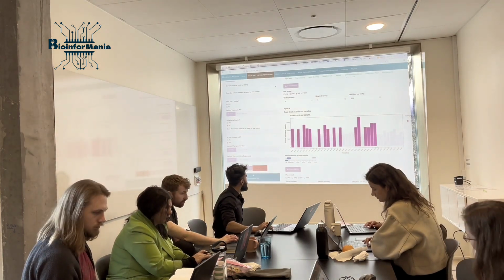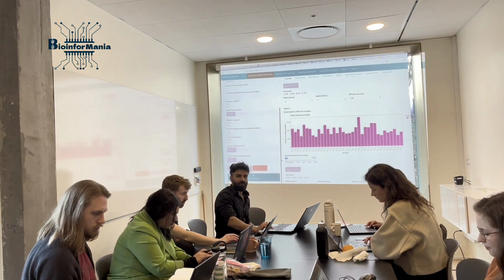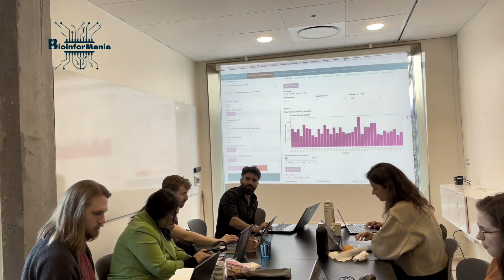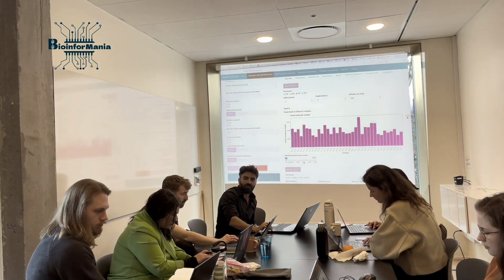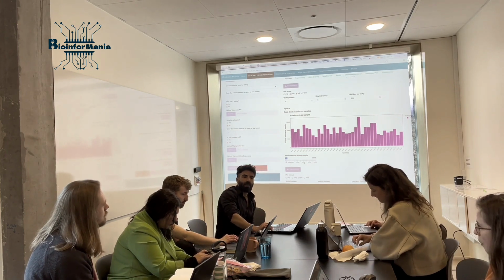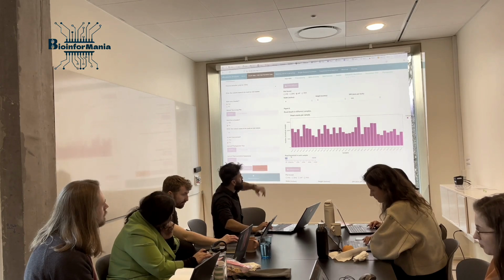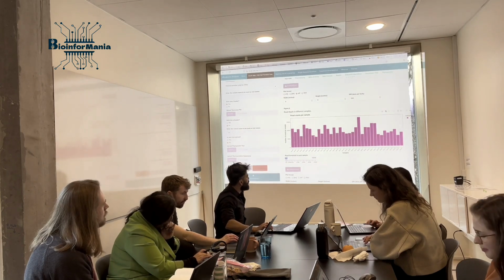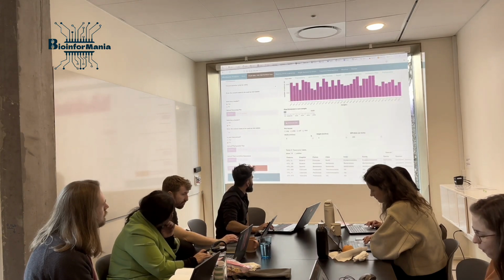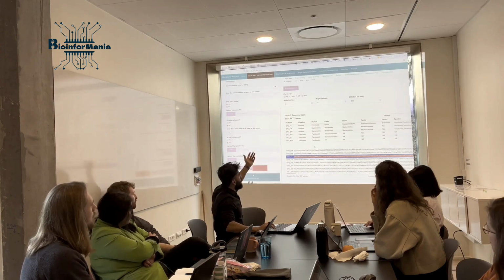So it tells you how many low, how many actually good you have. It's good just to have some understanding of it, okay? Maybe it's also good to have later on if you want to do rarefaction. I'll tell you what that is, for those people who know. This might give you an idea to select a threshold for it. Right? Again, we can download and not tell about it anymore.